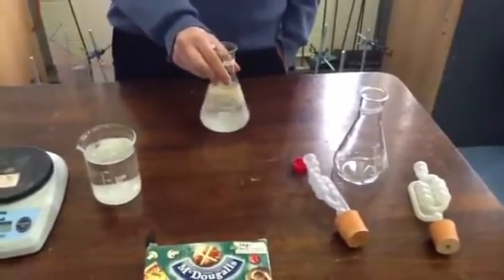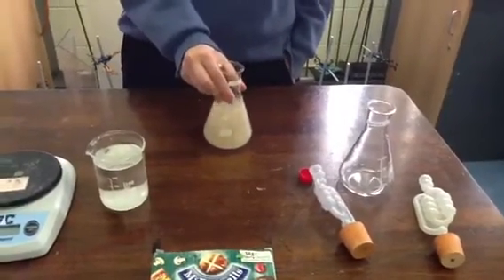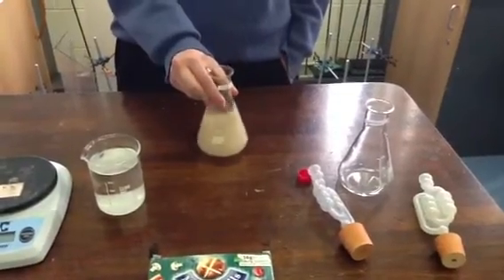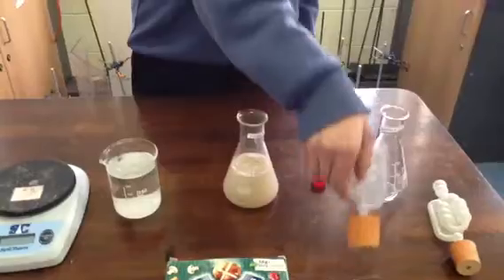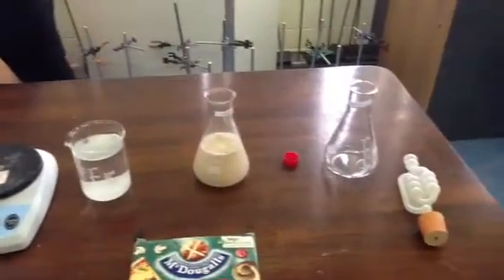Now we want to have anaerobic conditions. Ryan, how are we going to achieve anaerobic conditions? By filling the fermentation lock half full of water. That's going to allow CO2 out but prevent any oxygen from getting in.